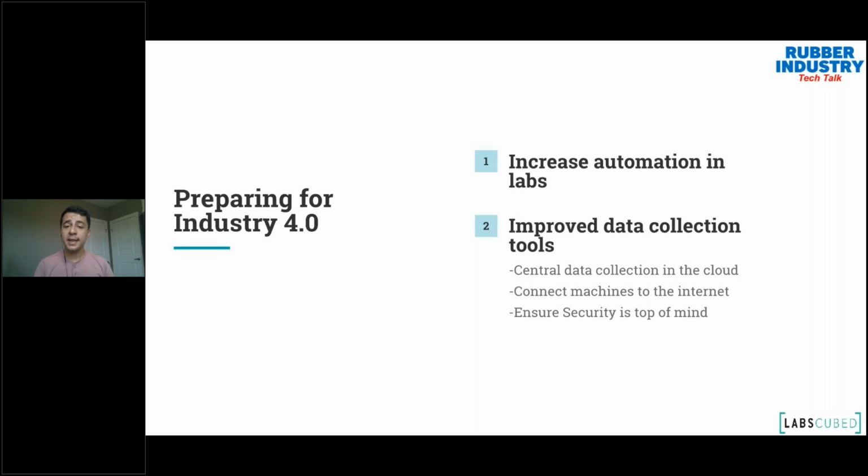And lastly, connect as many machines as you can to a very centralized system. I think a lot of companies we walk into are still using systems where each one is on its own, and then they collect the data and they put it in themselves. The faster you can speed up that process and the smoother you can make it, the better the whole system becomes in terms of Industry 4.0.